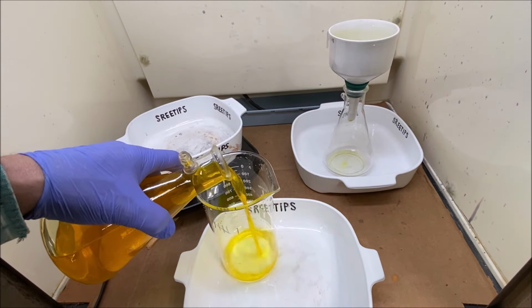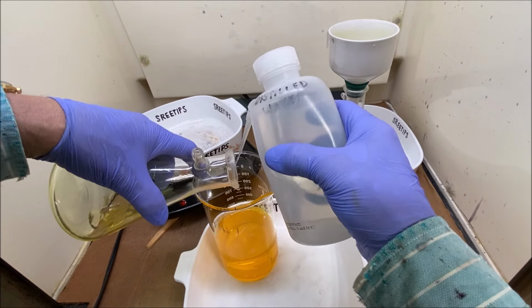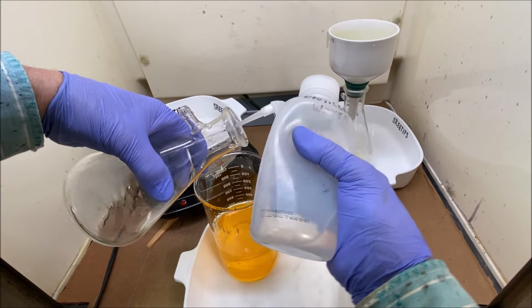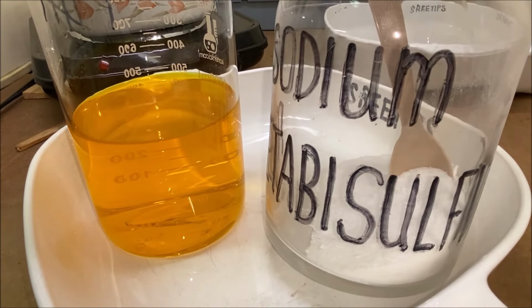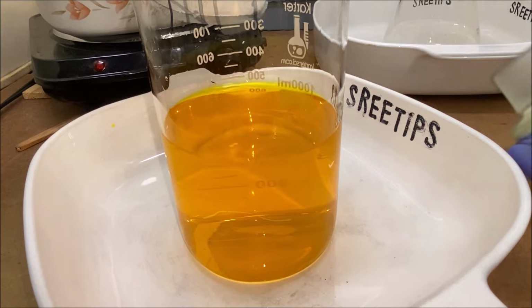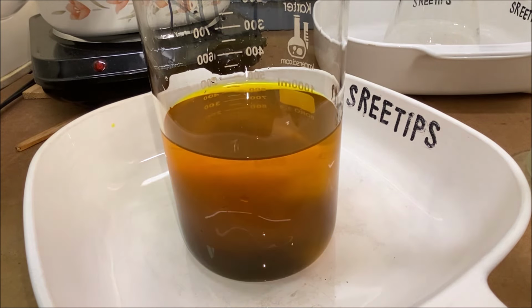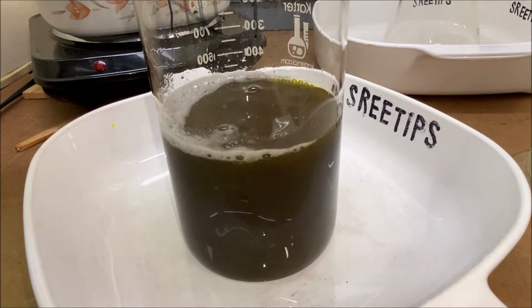I'm going to go ahead and just do a precipitation right now. This is only about 27 grams. What we're going to do is add some sodium metabisulfite and precipitate out the pure gold now for this first refining. That should do it.